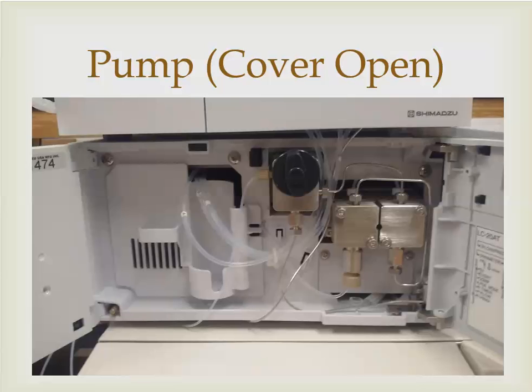So we just went through a couple of minutes of why the pump was so important. We said it pulls mobile phase from the top of the machine into the sample, mixes it with the sample, and then allows it to be injected on the machine and continues to push the sample and the mobile phase through the machine out of the other end. So the pump is a very important major player when it concerns HPLC analysis.